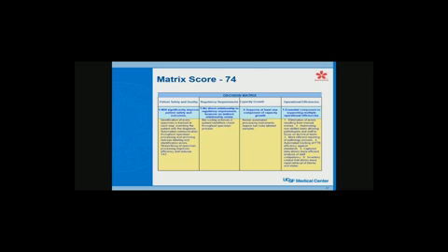So our main emphasis was patient safety, and really the impetus for even thinking about this was that we had 2 very severe mislabeling errors that led to patients getting the wrong treatment. Luckily, nobody was harmed by that treatment, but it was a real wake-up call, and the institution asked, what are you going to do about this? And this is what we said: barcoding is going to help us prevent these errors. So that was a big justification.